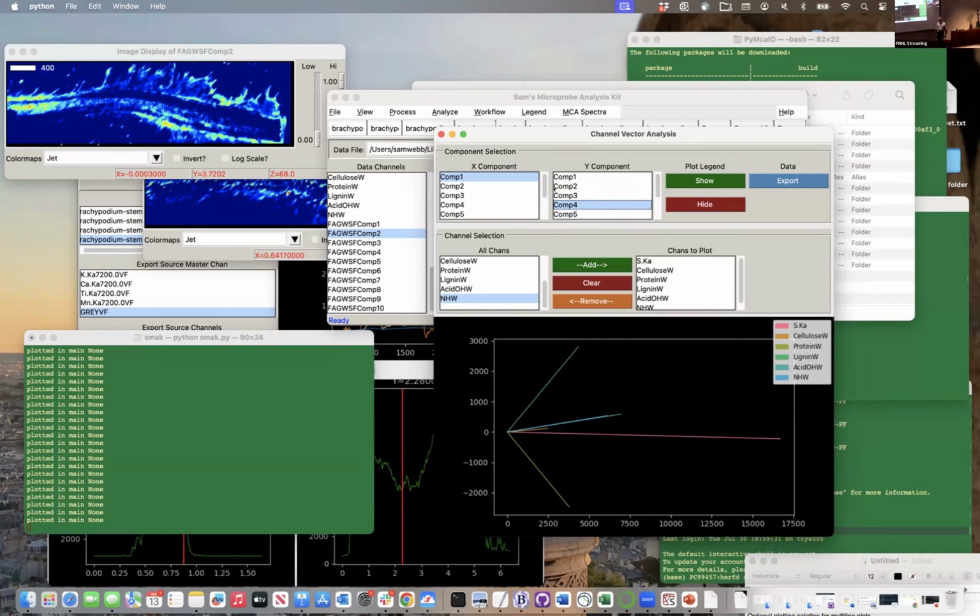And I would even hazard that, as we touched on a little yesterday during the fiducial parts, it's amazing how good a Sharpie can be sometimes. It's an easy one. Everyone's got a Sharpie in their lab. It has a great iron signal and a very unique MALDI signal. It was actually really helpful.